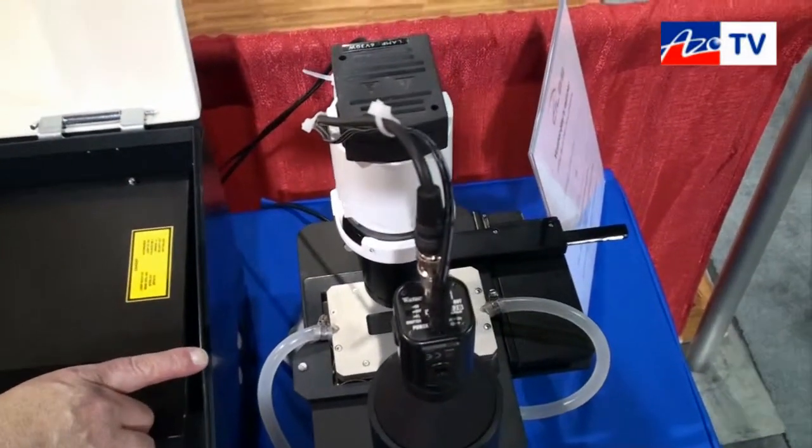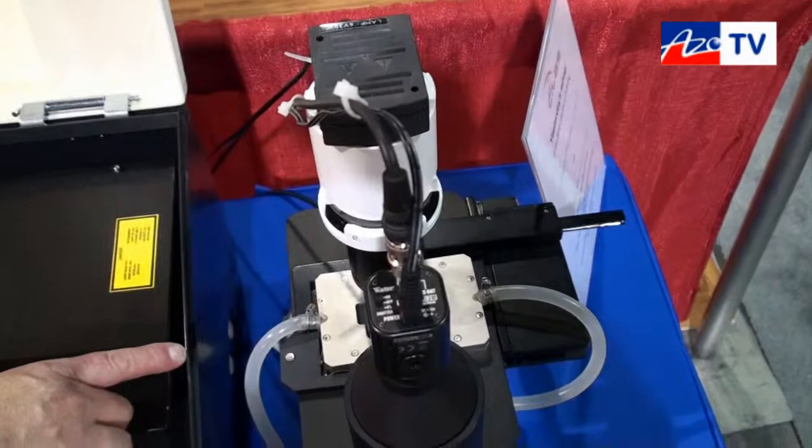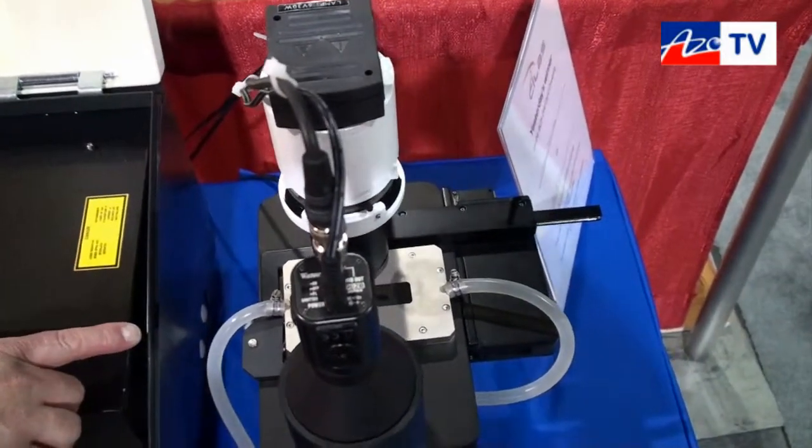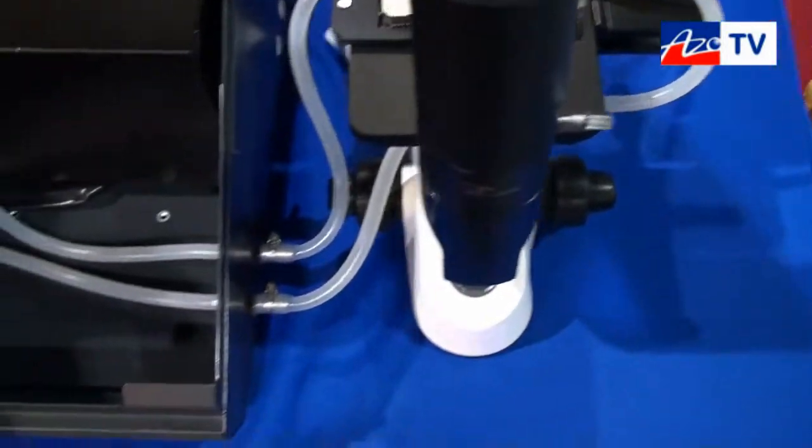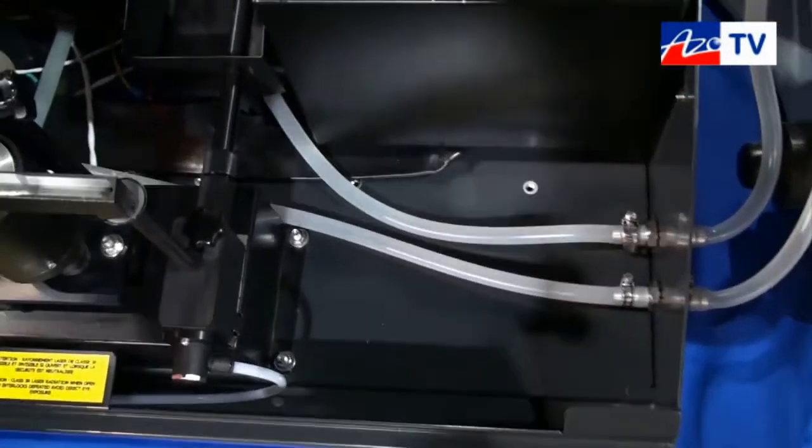So we're actually looking at the same aliquot of sample that's in the particle size analyzer as it is in the particle shape analyzer that feeds back, comes back into the tank, so it's a closed loop system.